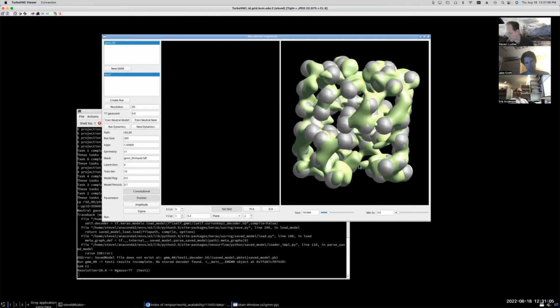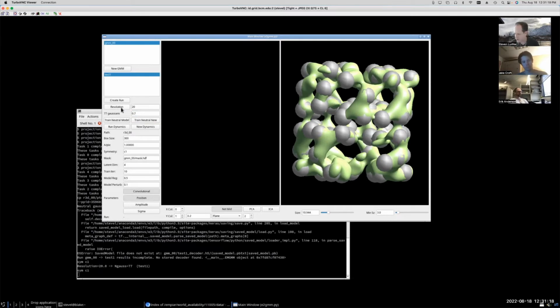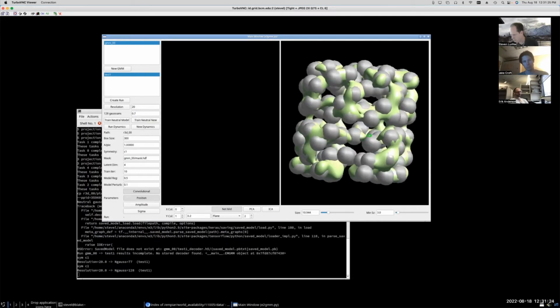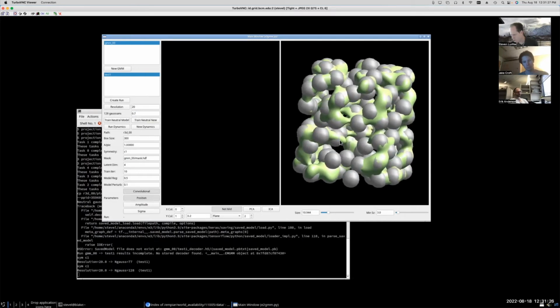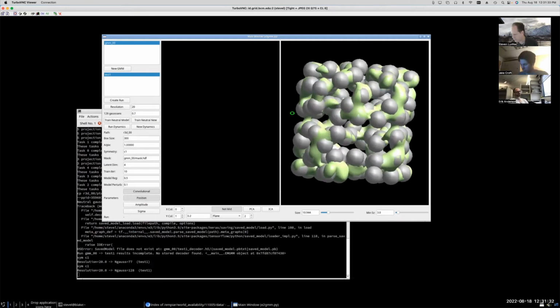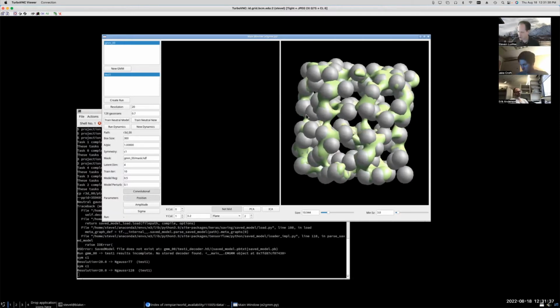Once we've blurred it out here, it looks like empty space, or almost empty space. So we didn't get any Gaussians there. So we'll probably have to lower the threshold a little bit. That'll give us a few more Gaussians at the same level of detail. And now you can see we've got at least a couple of Gaussians here, which are occupying that missing space. We might still run into some problems finding it that way. And I'll also point out that mixing motion and discrete variables in a single run sometimes also has some issues.